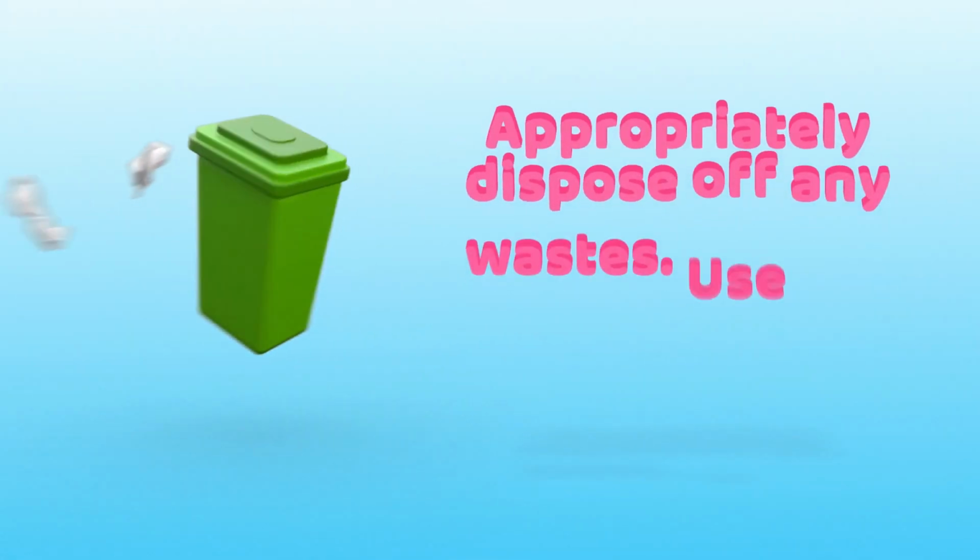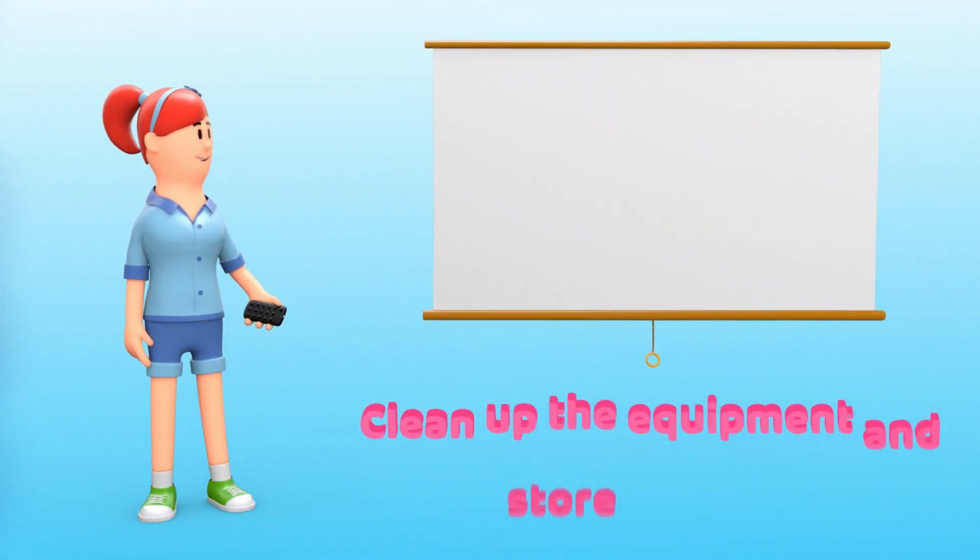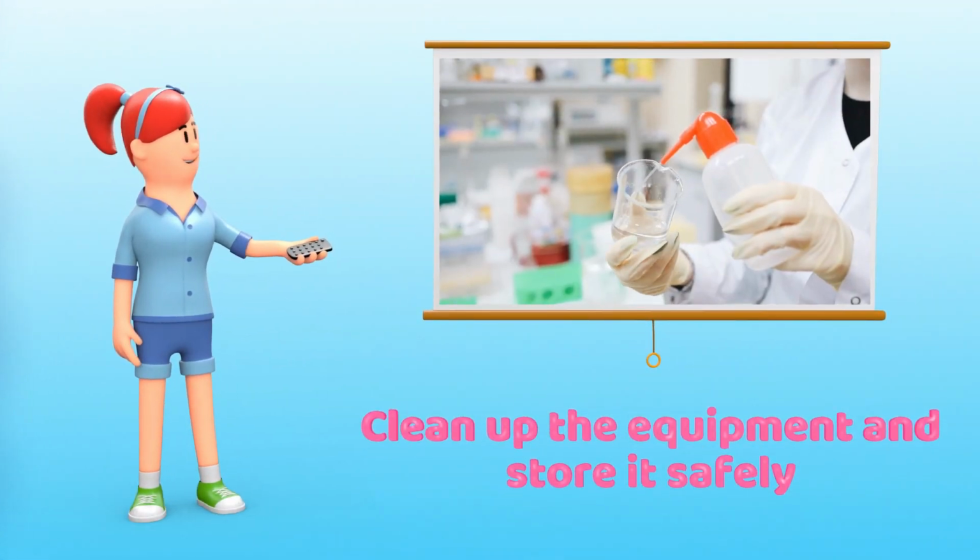When you have finished your experiments, remember to collect all the solid wastes and use the litter bin and not the sink to dispose of any solid waste. Without forgetting, clean up the equipment and store it safely.